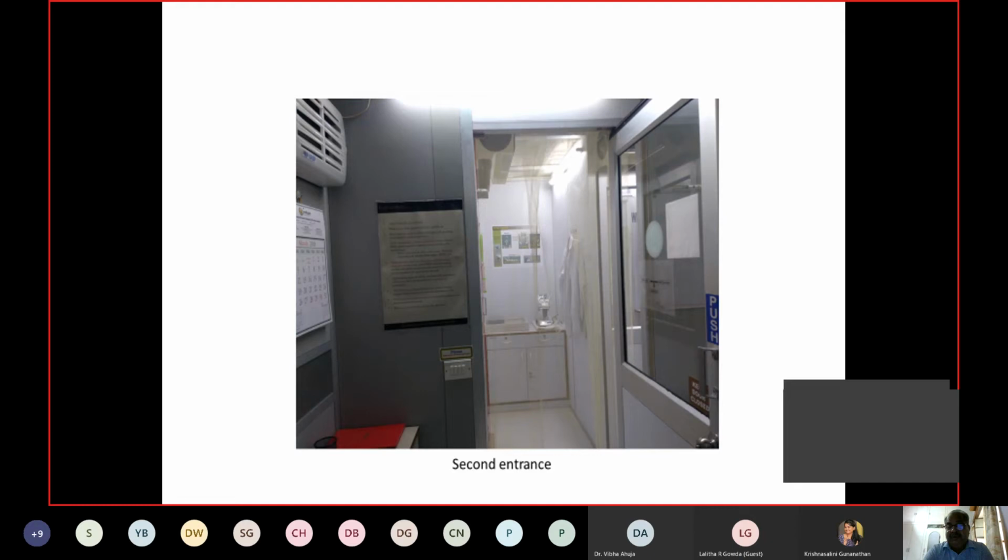For example, people coming with outer shoes will not run berserk within the laboratory range. They have to see that their shoes are put off outside the laboratory, and they wear closed shoes, linen shoes, or other kinds of smaller slippers which are maintained for the laboratory work, and then only they enter. So there are rules already placed on the rules board, and everybody is supposed to know about them before entering into the laboratory, the arthropod containment laboratory.